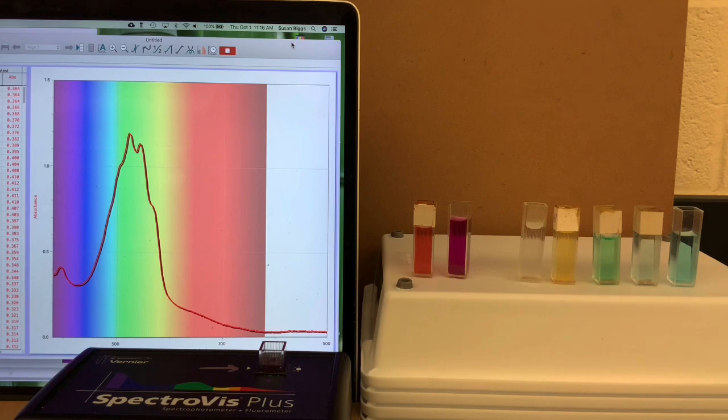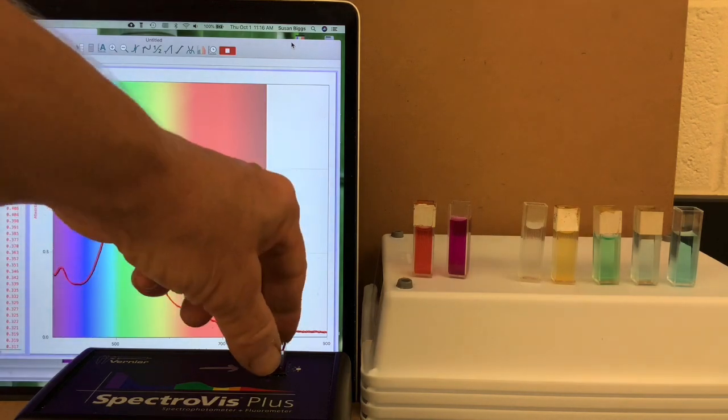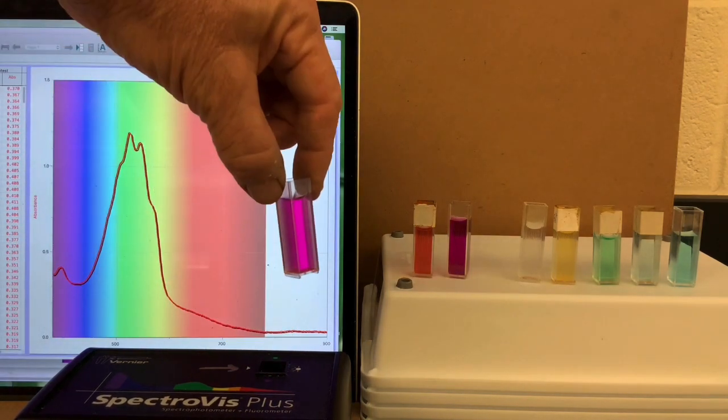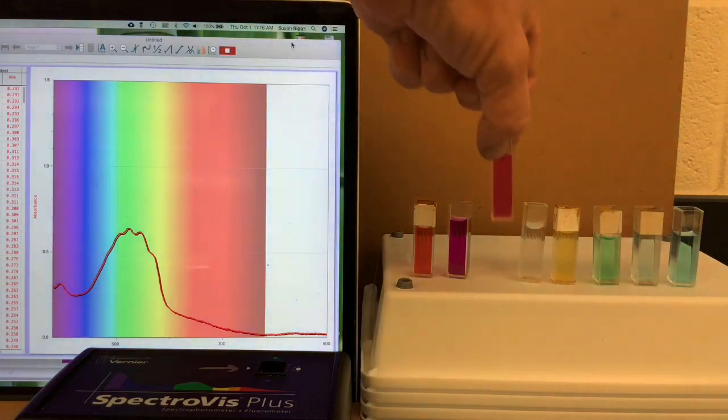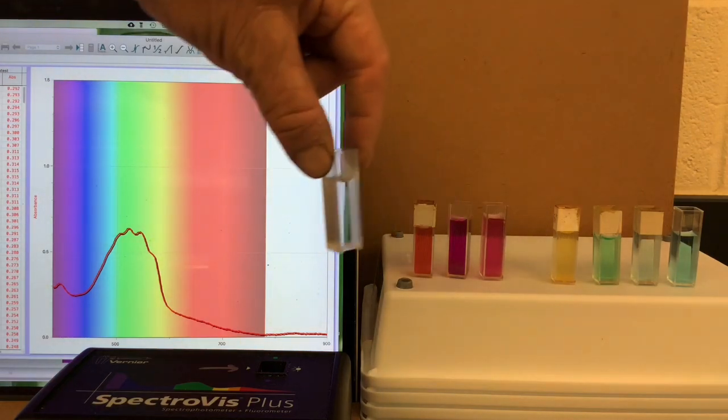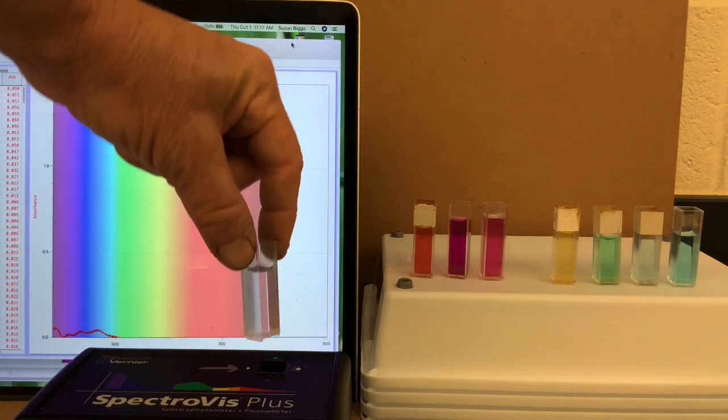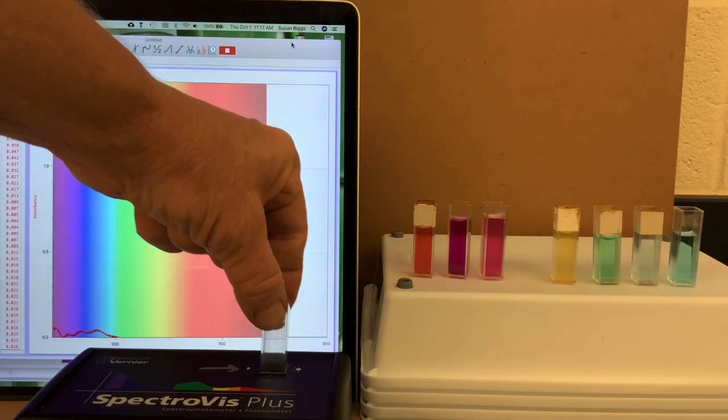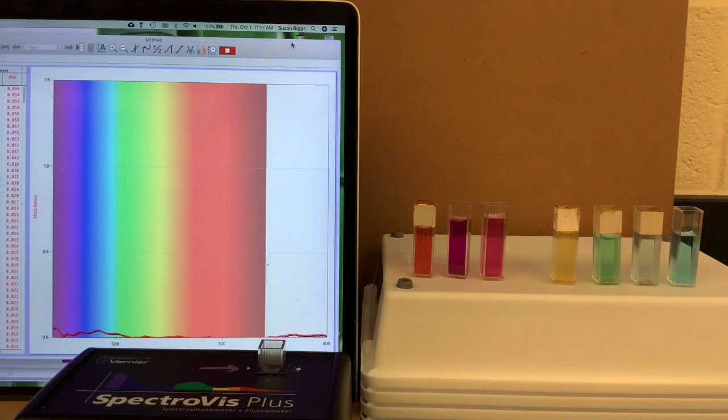It's got an interesting little jag at the top of its peak. Zinc. Purple solution. Absorbing what color? This is zinc, which is colorless. Hmm. No absorbance at all.